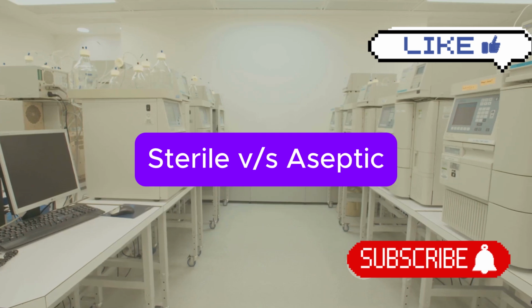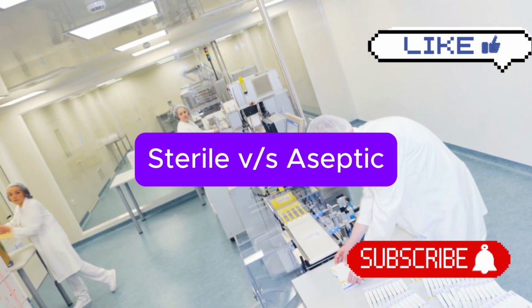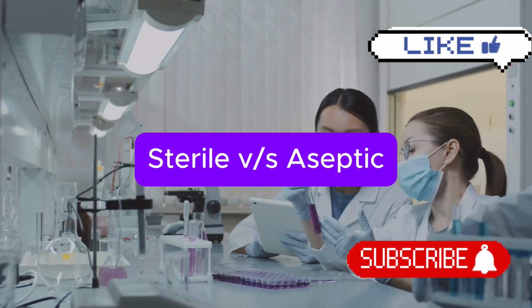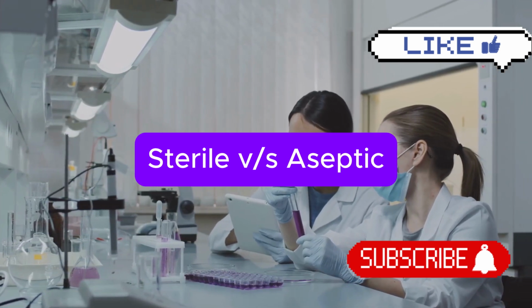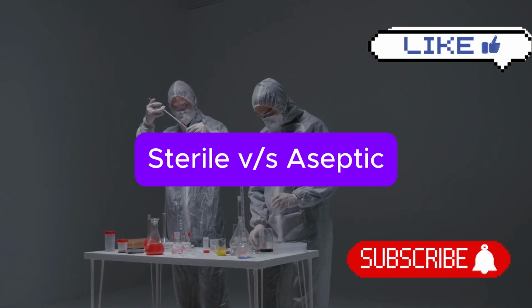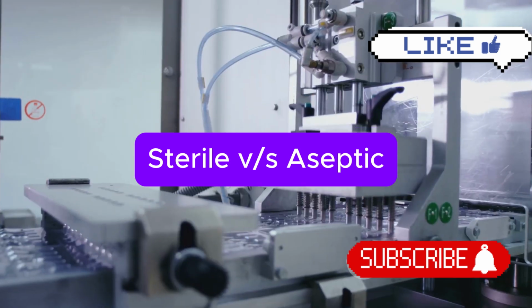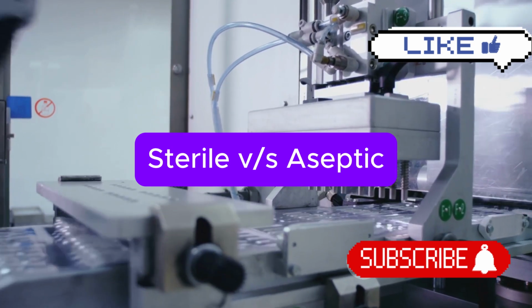Section 6. Real-world examples, sterile and aseptic areas. Let's look at some real-world examples to illustrate sterile and aseptic areas in the pharmaceutical industry. A sterile area could be a small, enclosed space within a laboratory where scientists handle cell cultures for drug development. These cultures are extremely sensitive to contamination, so the environment must be completely sterile to prevent any unwanted microbes from interfering with the experiments.